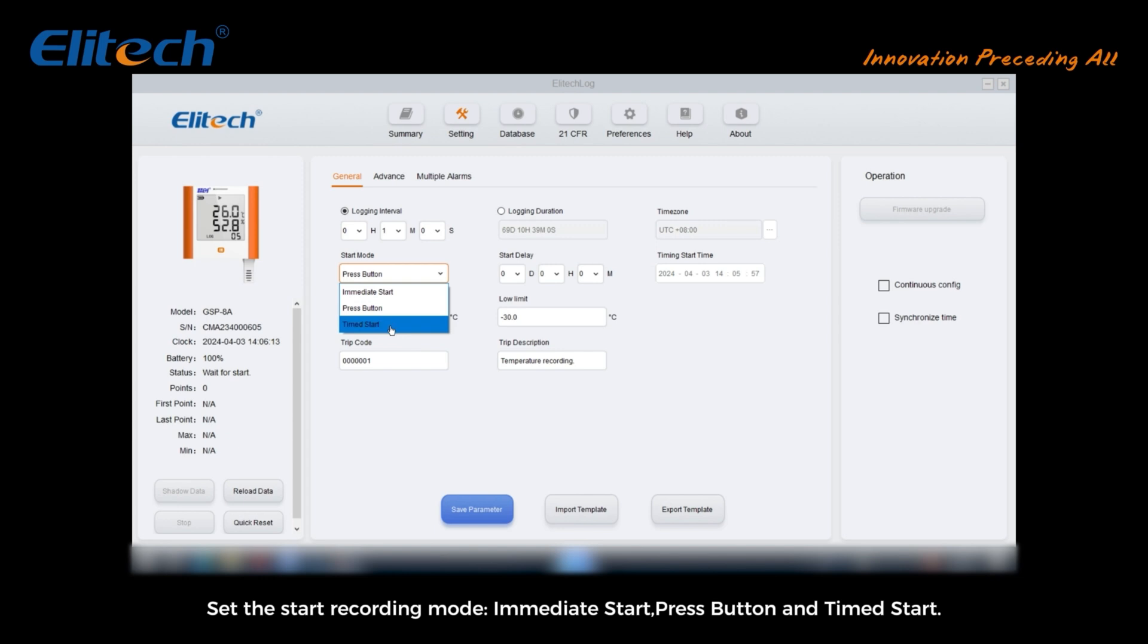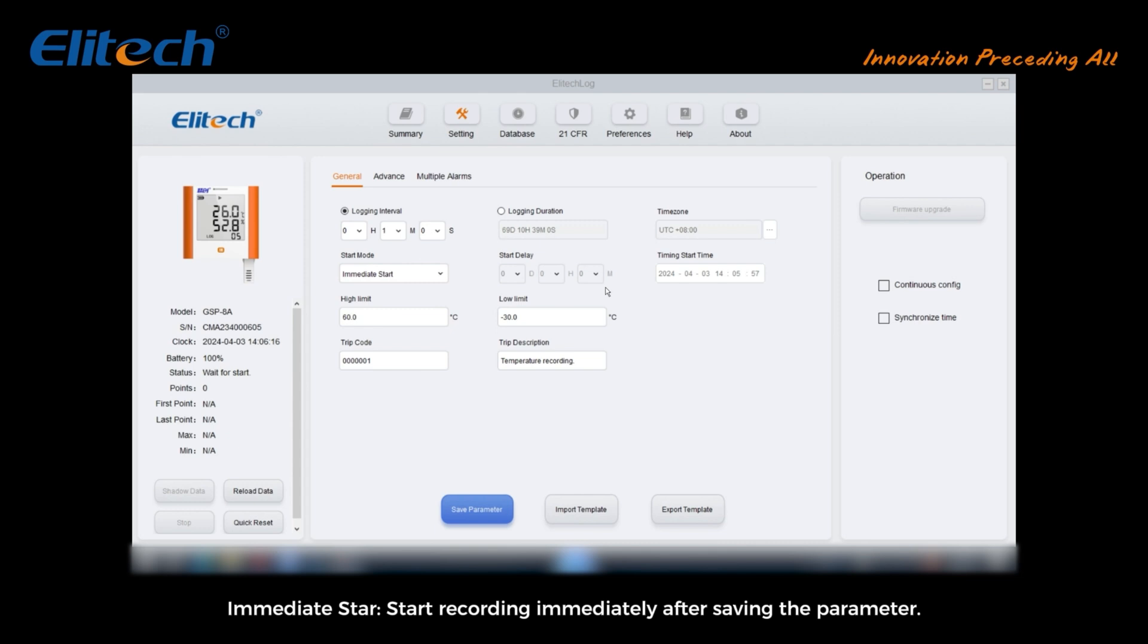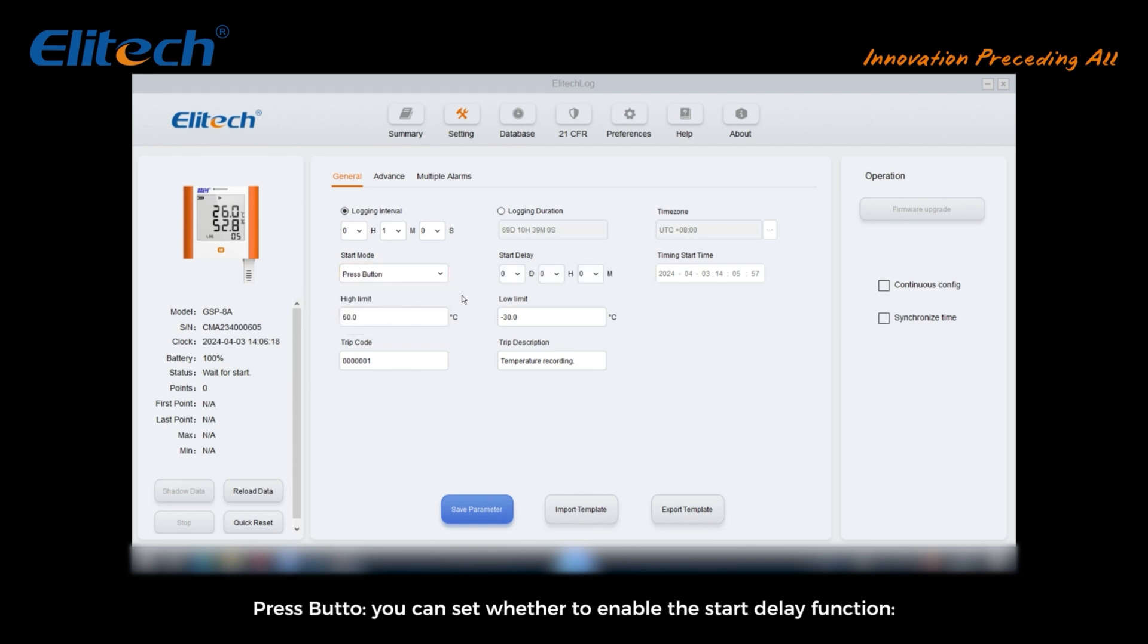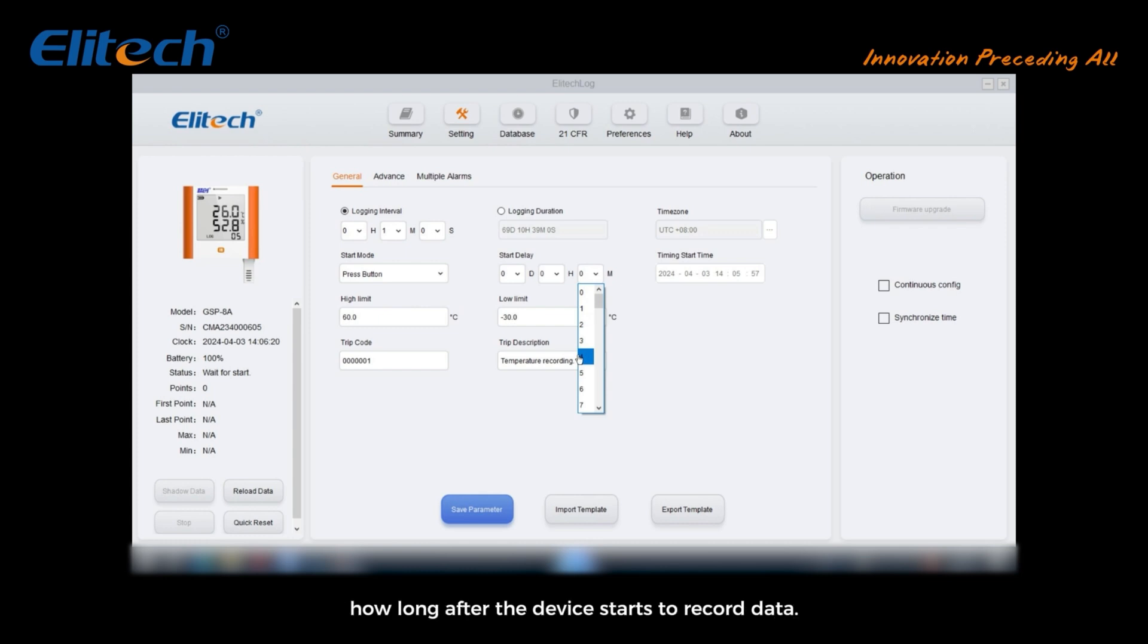Set the start recording mode: immediate start, press button, and time start. Immediate start: start recording immediately after saving the parameter. Press button: you can set whether to enable the start delay function, how long after the device starts to record data.